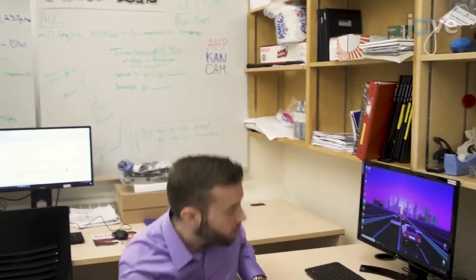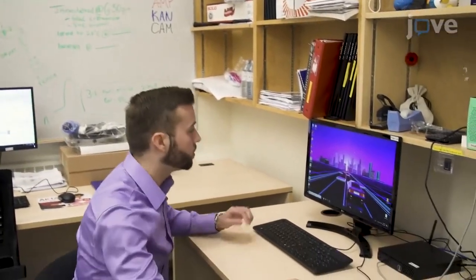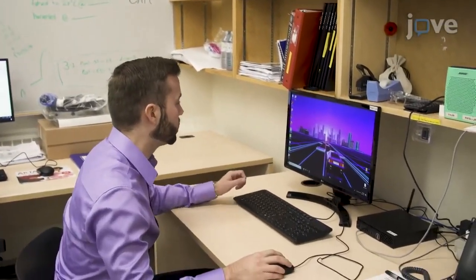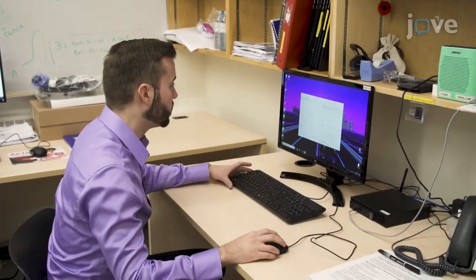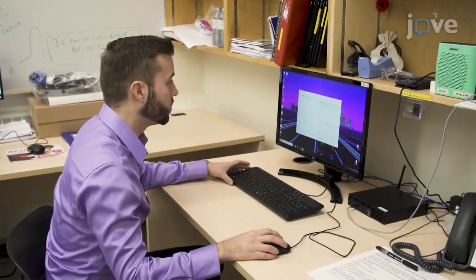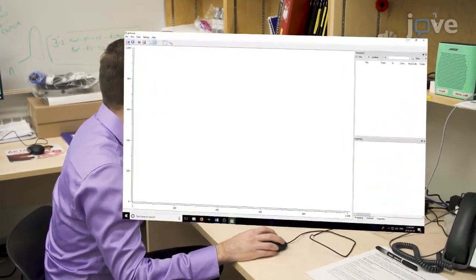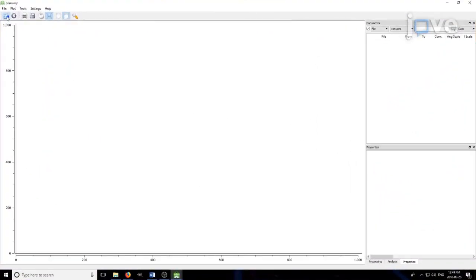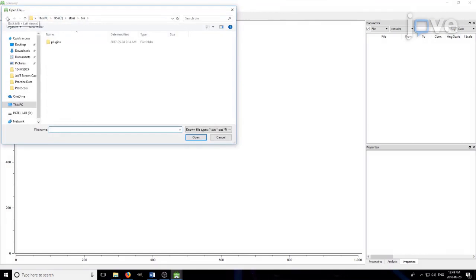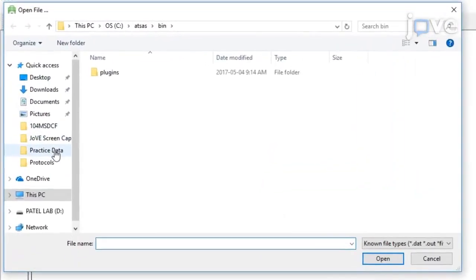To begin, install and load the ATSAS program suite. Open the Primus Qt program and go to the Open menu option.